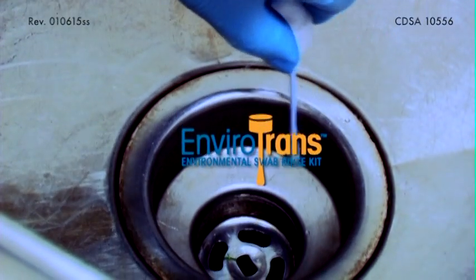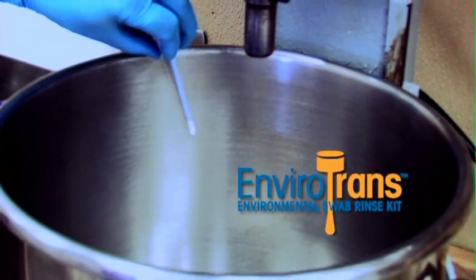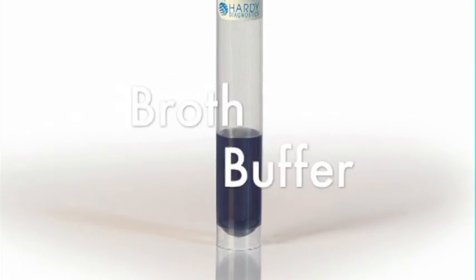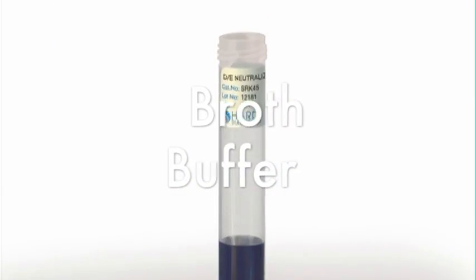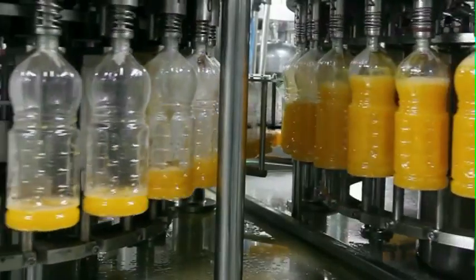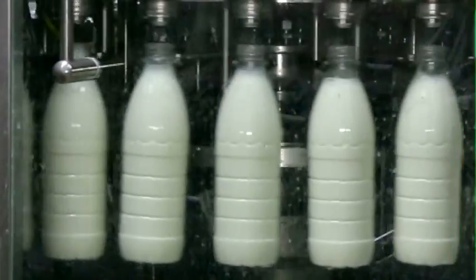EnviroTrans Environmental Swab Rinse Kit is a ready-to-use swab and tube, pre-filled with your choice of transport solutions to fit your specific needs. Each EnviroTrans tube contains broth or buffer. EnviroTrans is excellent for detection or enumeration of microorganisms from environmental surfaces or equipment.